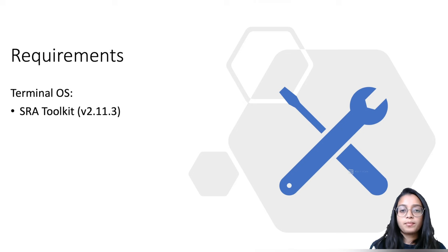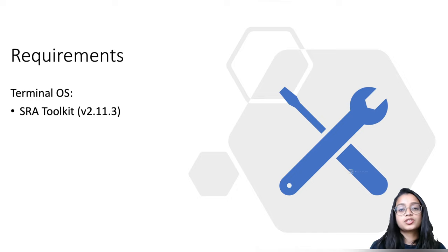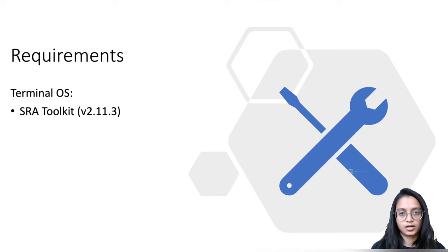For today's requirements, I'm just going to be using the SRA Toolkit. I'll start by demonstrating how to download and configure the SRA Toolkit, and then we can switch screens to the terminal where I can show you how to actually retrieve the data from the NCBI servers onto our local computers.